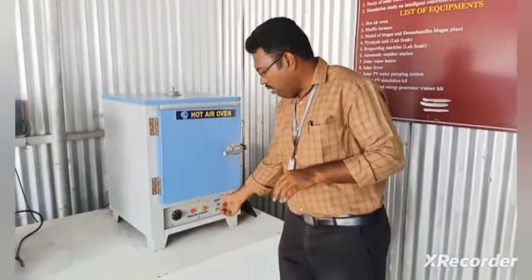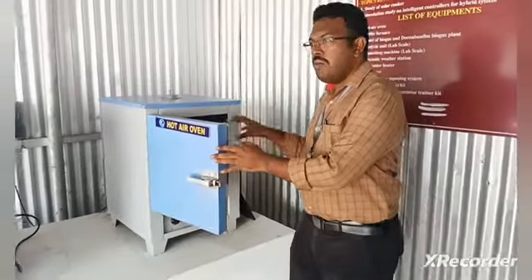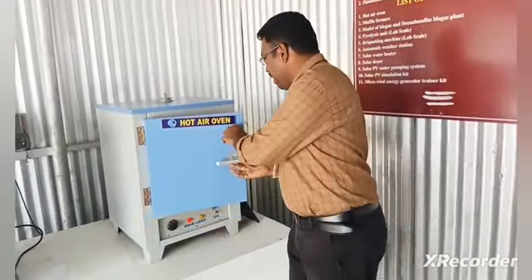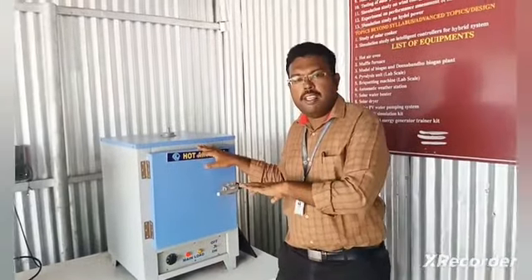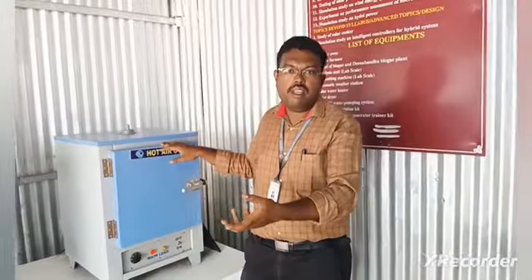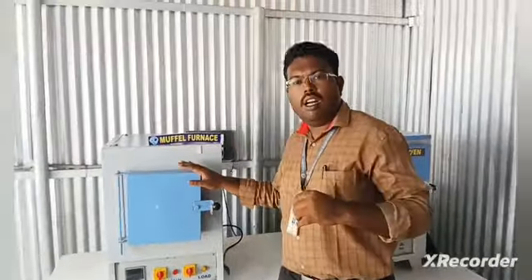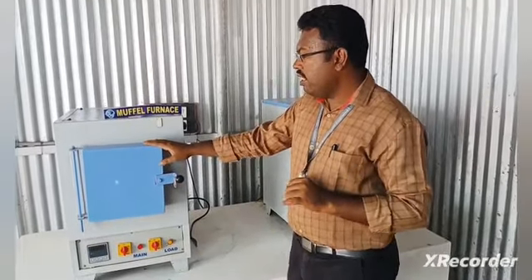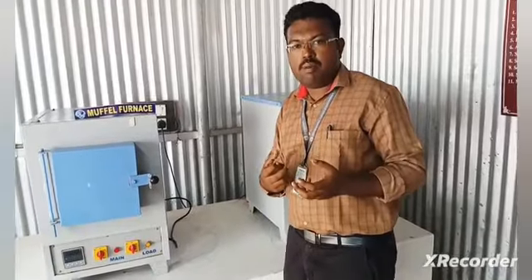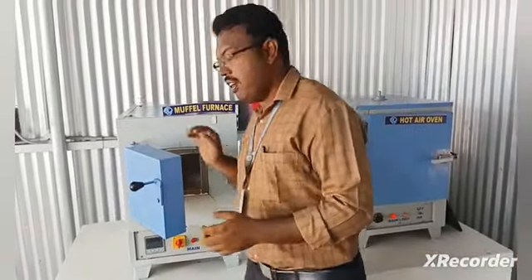Once it is done, we switch off the main load, and after that we take the biomass material from here. Then we take the weight of the biomass material using the weighing scale. Before keeping this biomass material in, we take the weight at the initial condition. After taking it from here, we find out the ash content using the muffle furnace, using the same biomass material.